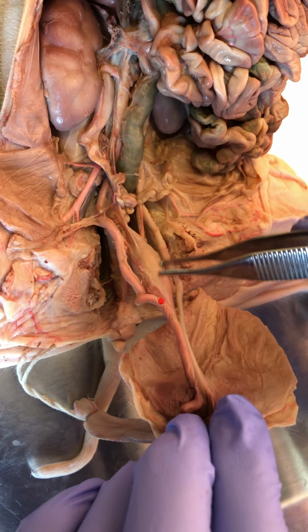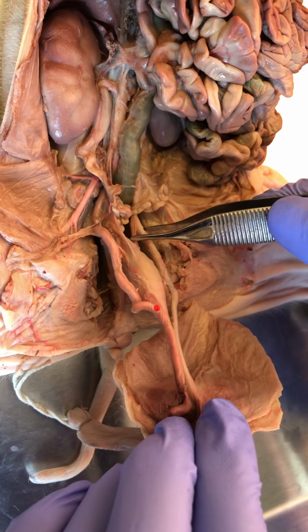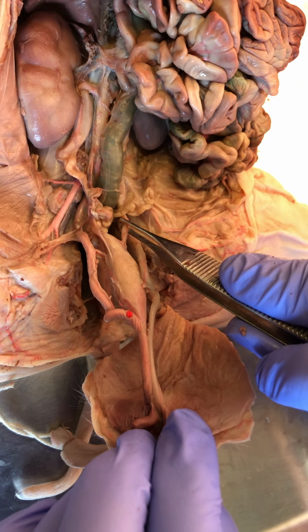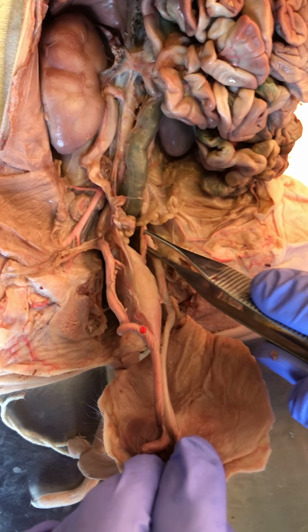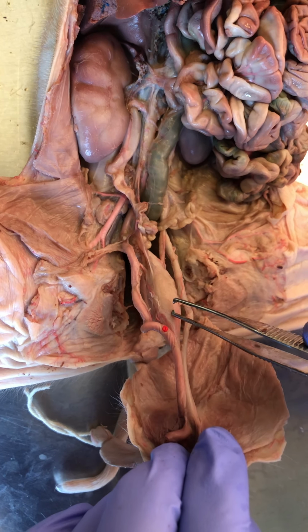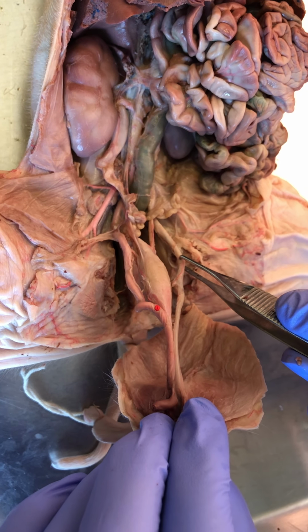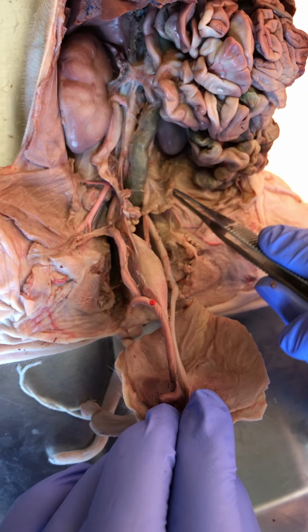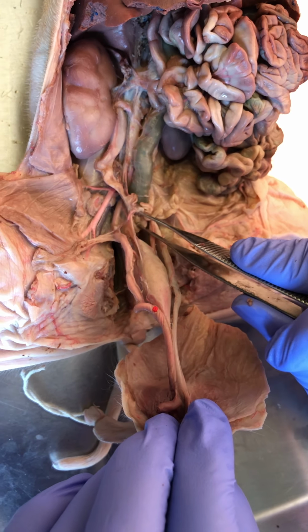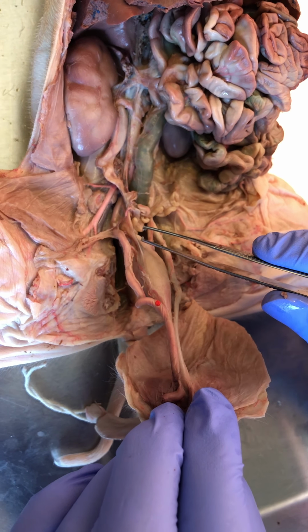The urinary bladder is a structure right here. It's really muscular, and interestingly enough, it loads from the bottom. Right there is where the ureter from the left side is draining. So it's a bilateral structure: ureters draining into this midline structure, the urinary bladder, with, of course, the umbilical arteries on either side. We have some reproductive structures in between, so you're just going to filter those out. There's a good view of the distal portion of the ureter.